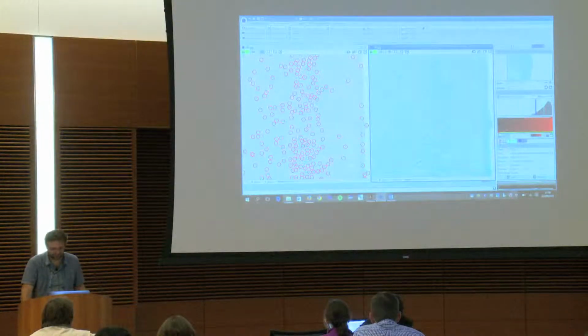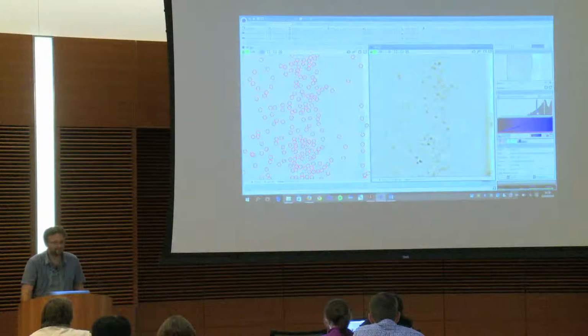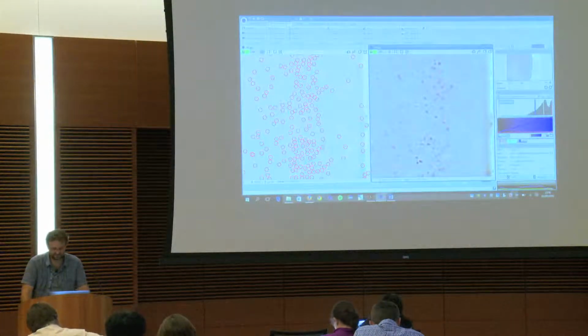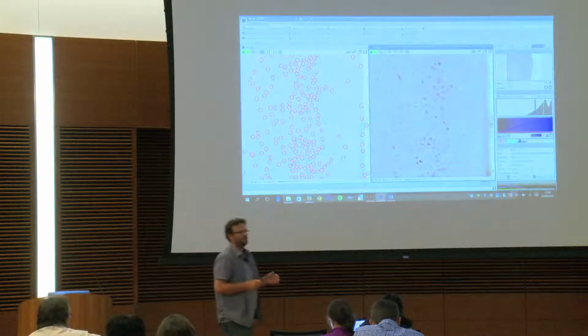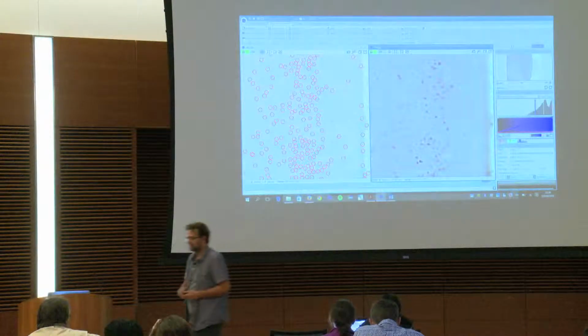Of course, it's because this is a bright field image, so we need the 3 different channels synchronized. If I do this with the green and I do this with the blue, I still have a shift. So what is cool is that if you maintain shift while you move, then you keep the consistency of the color balance. So now, it's easier for you to tell me if you agree with the detection.